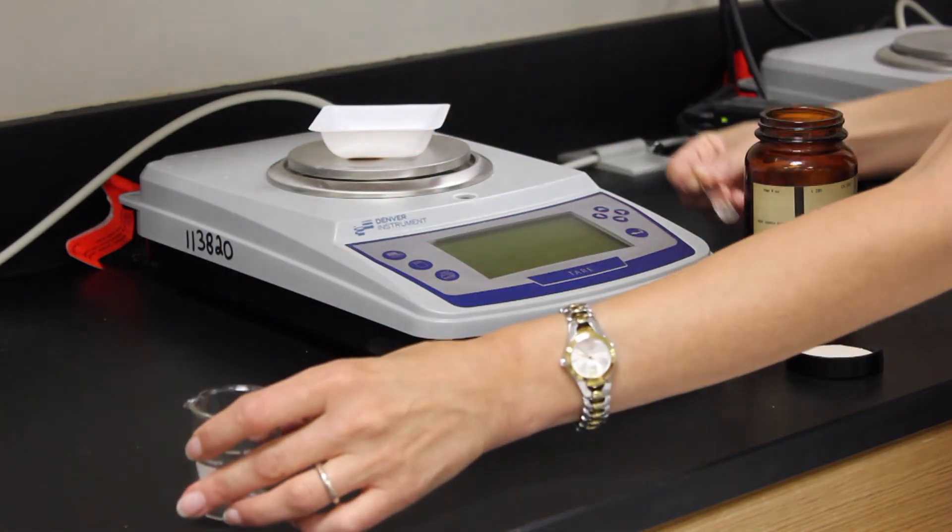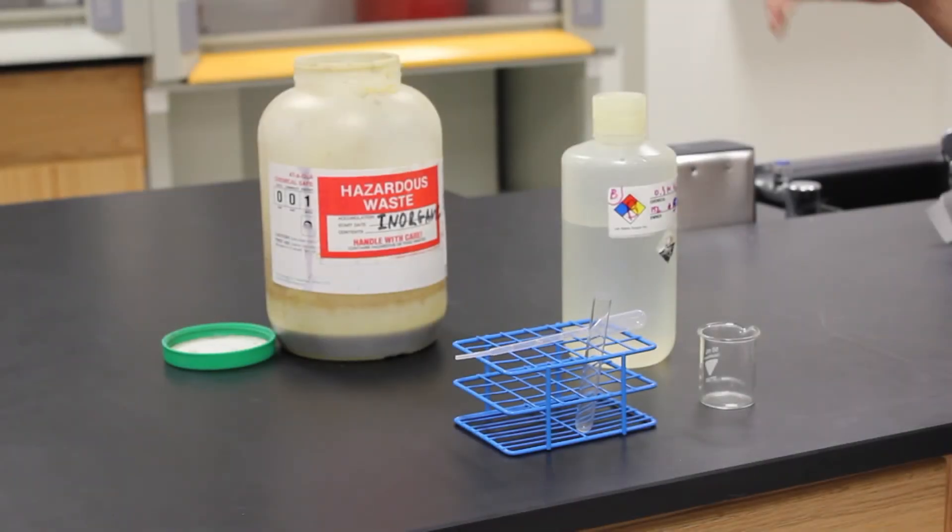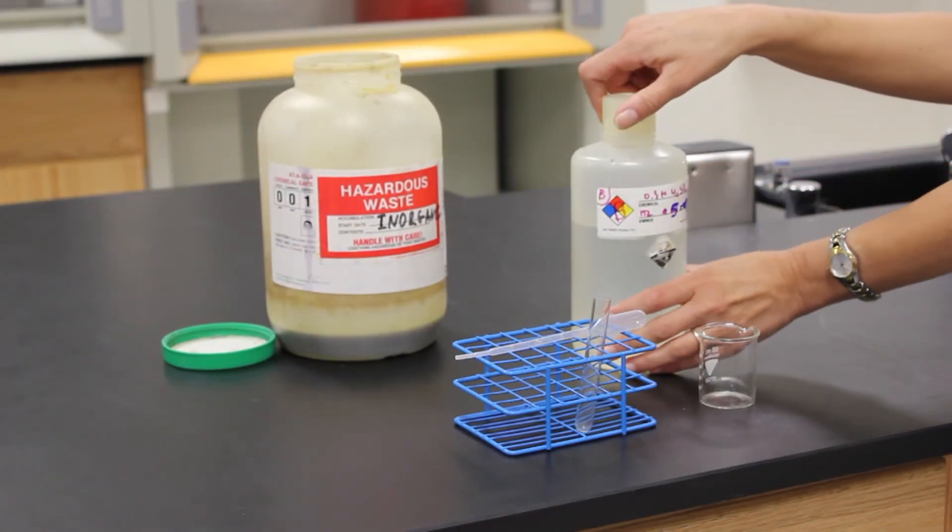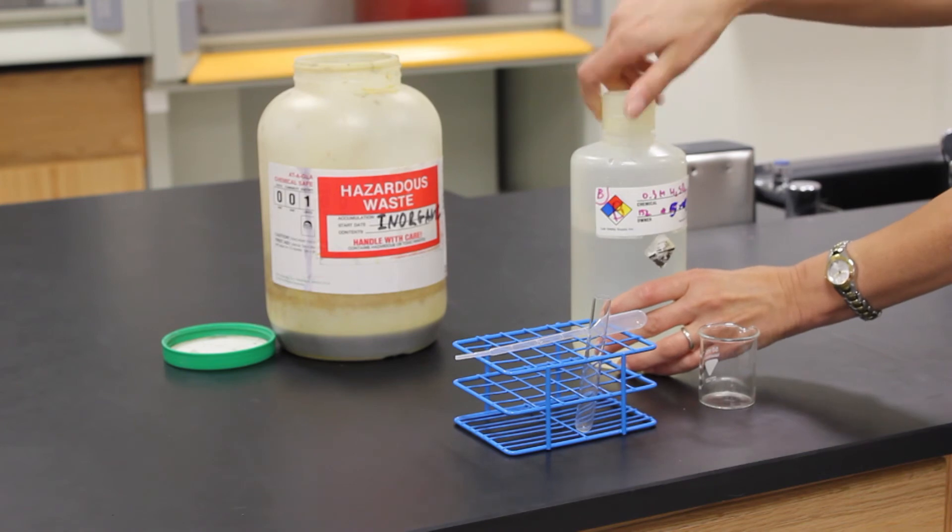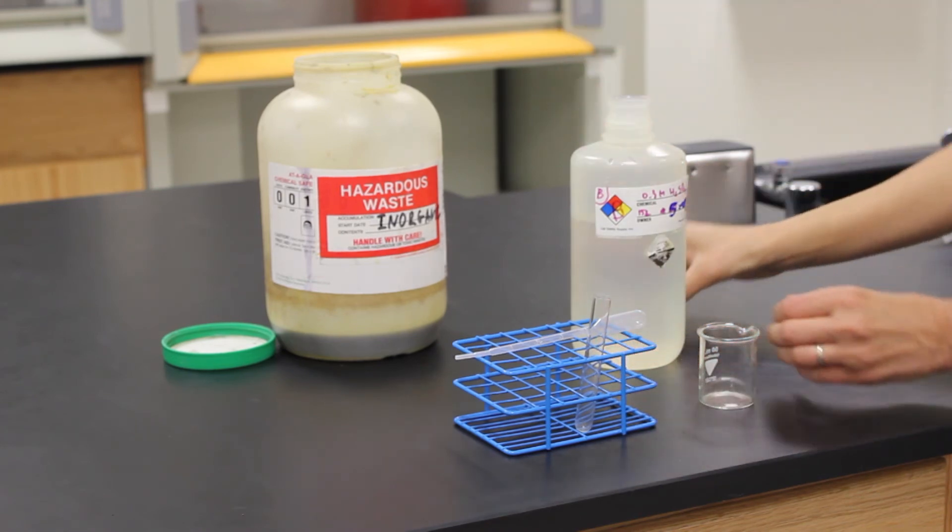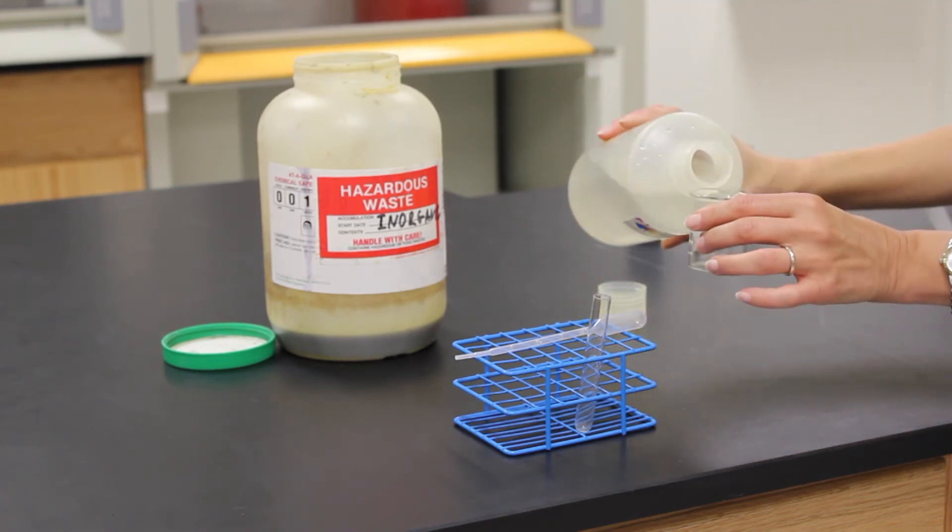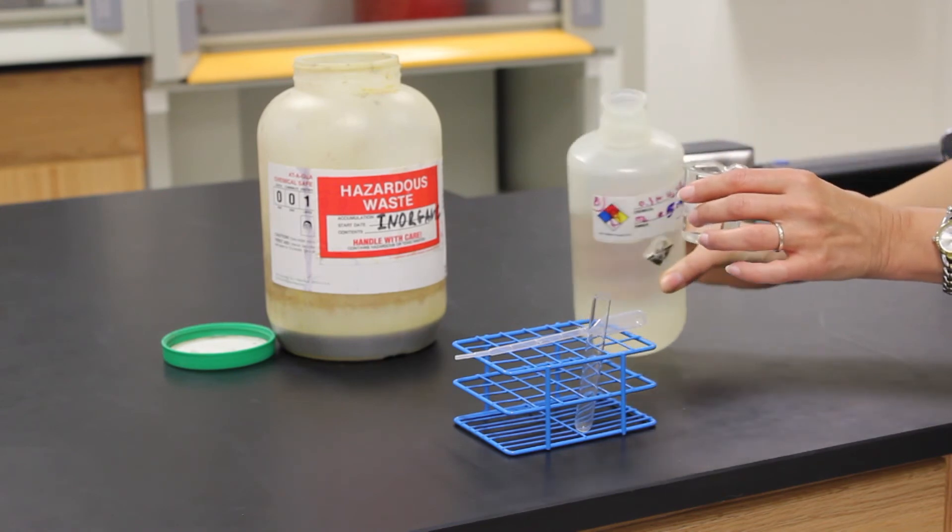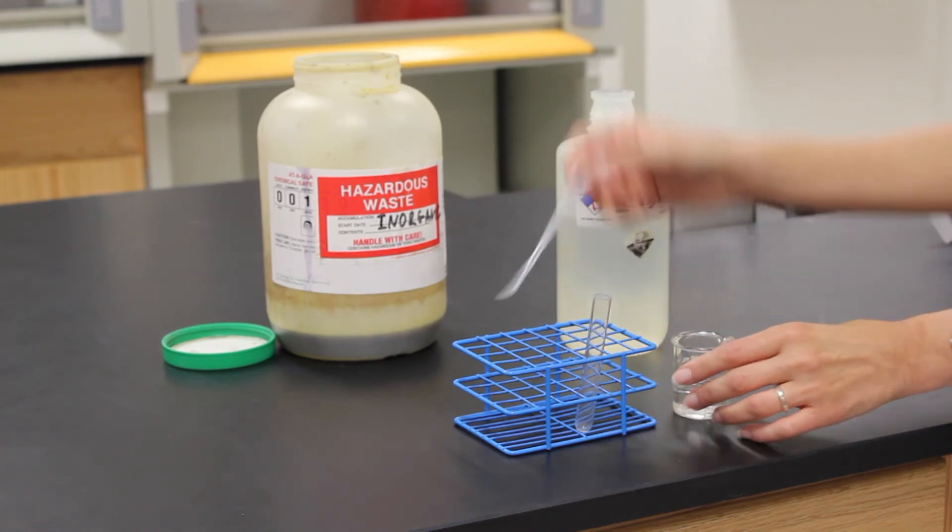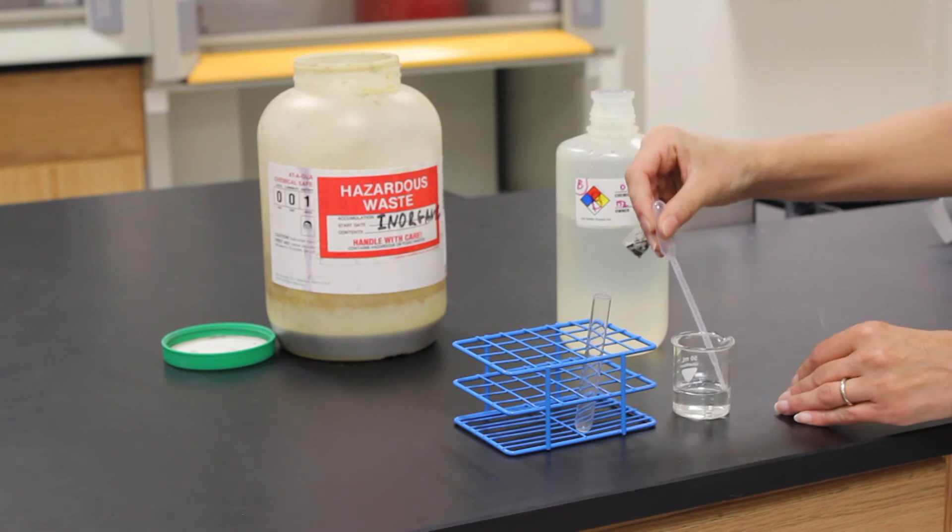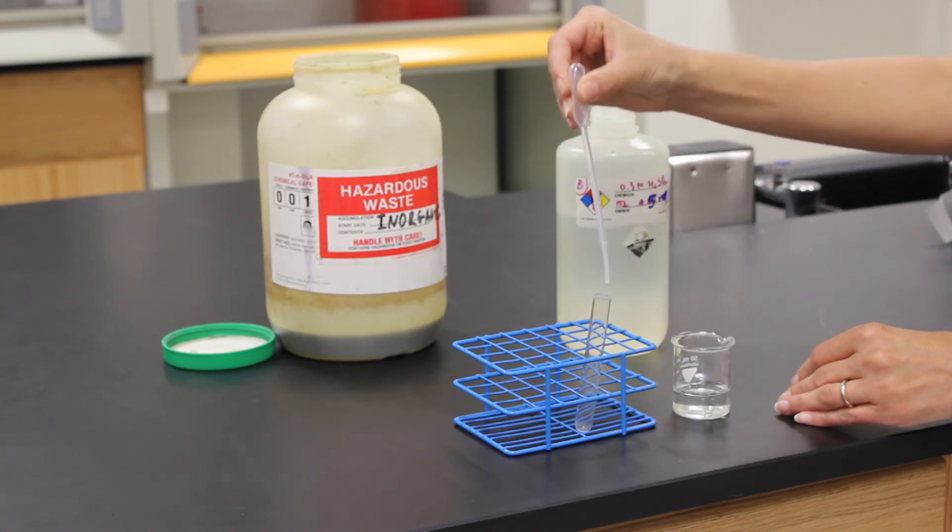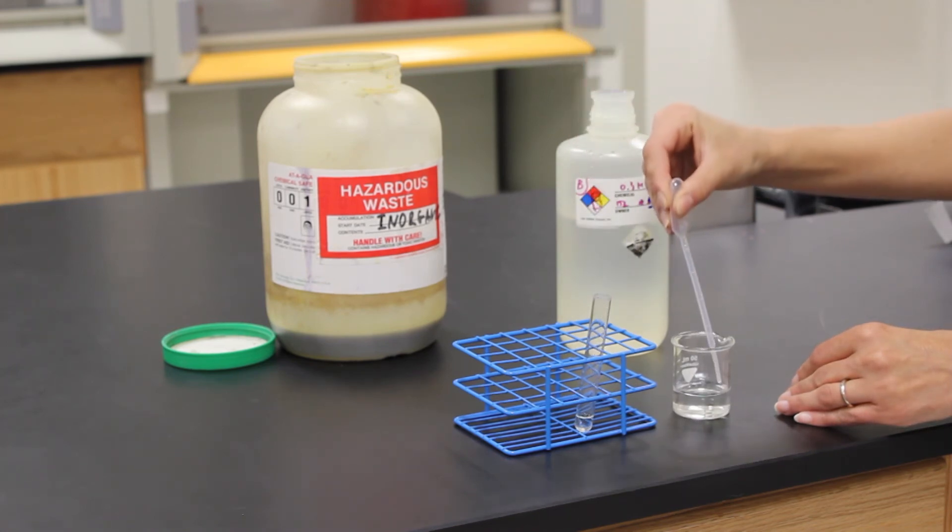Obtaining liquids is much the same. Pour a small amount of the liquid into a small beaker or other appropriately sized container. Use a pipette to transfer the amount of liquid you need.